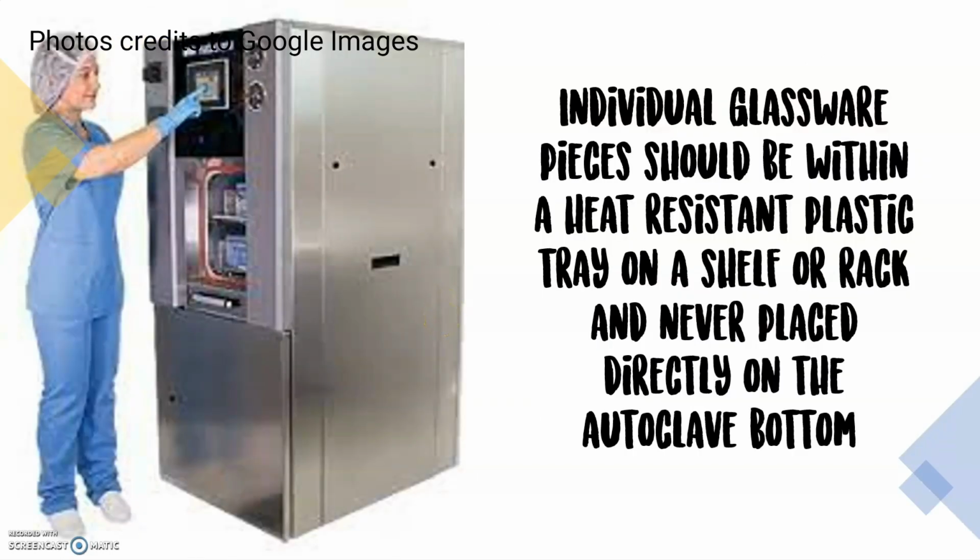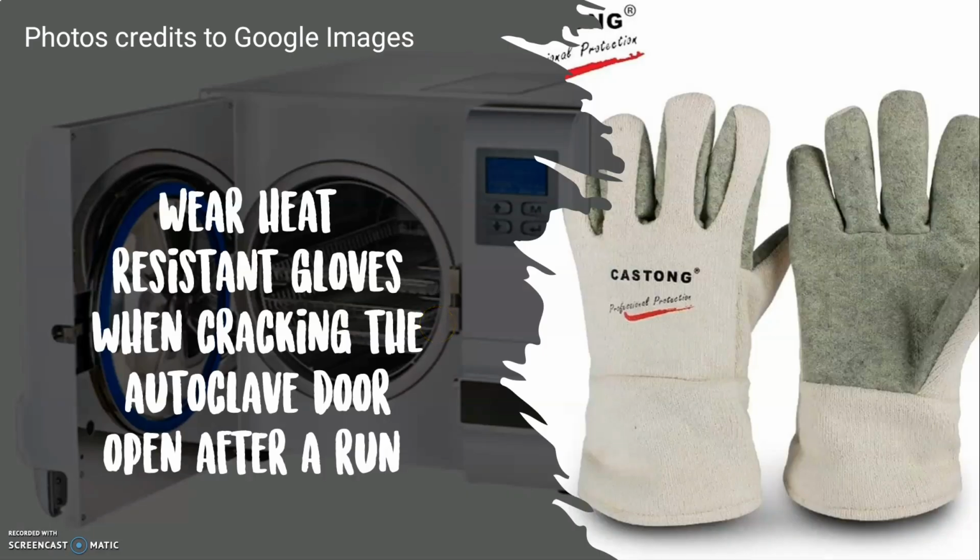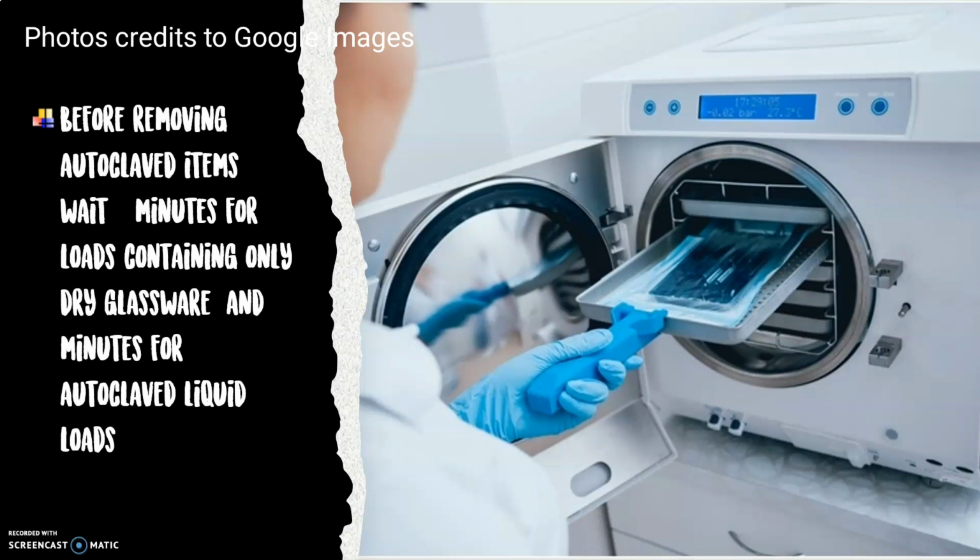Individual glassware pieces should be within a heat-resistant plastic tray on a shelf or rack and never placed directly on the autoclave bottom. Make sure the door of the autoclave is fully closed and the correct cycle has been selected before starting the cycle. Wear heat-resistant gloves when cracking the autoclave door open after a run.